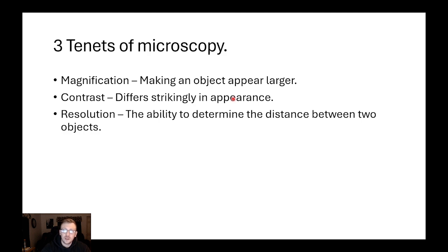So the ability to determine the distance between two different objects, which we're going to get into, resolving power and why that matters so much more, even more so in my opinion than contrast and magnification.